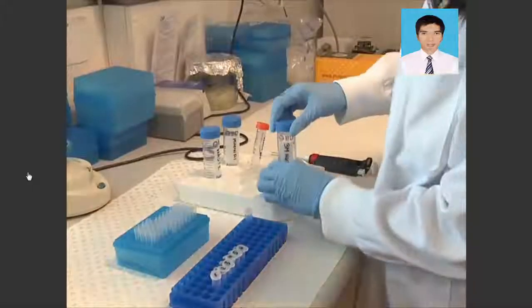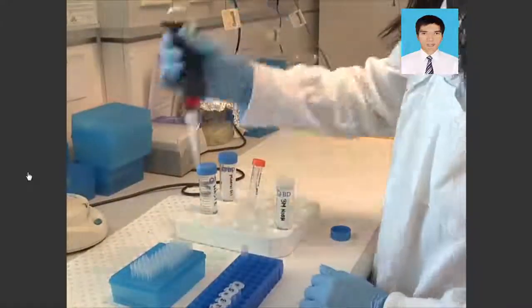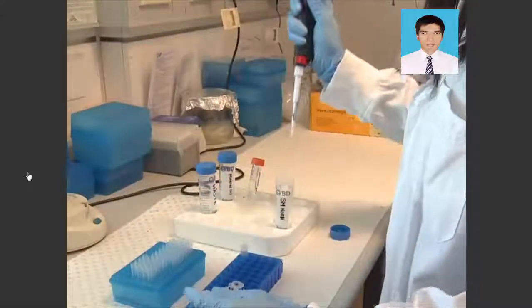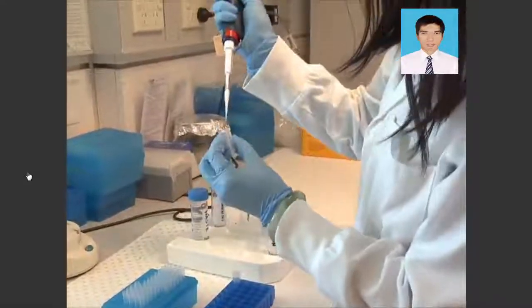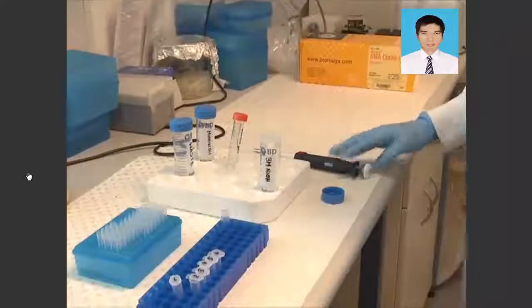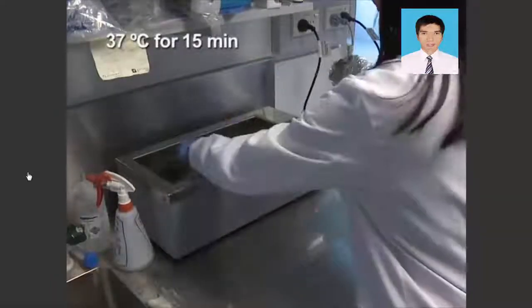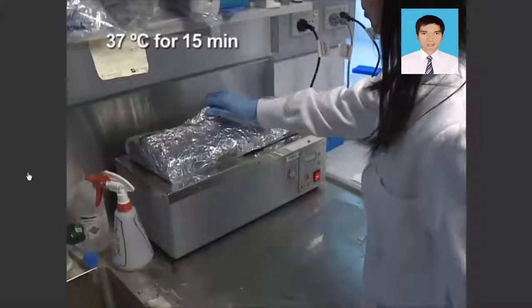The next step is to remove the bisulfite adduct from the uracil ring by desulfonation. To accomplish this, add 5.5 microliters of freshly prepared 3 molar sodium hydroxide to each bisulfite-treated DNA sample for a final concentration of 0.3 molar. Then incubate the samples at 37 degrees Celsius for 15 minutes.